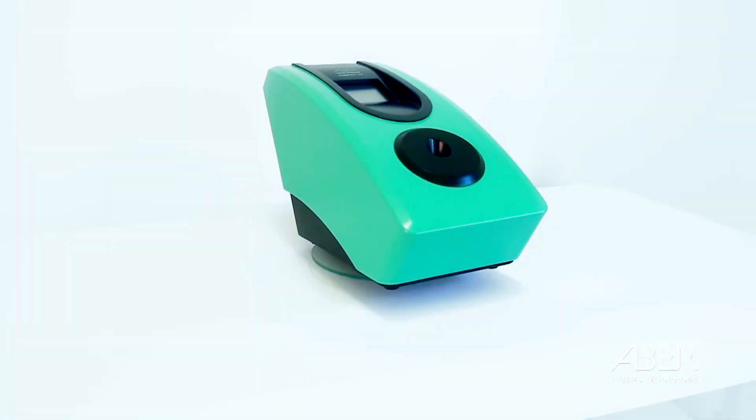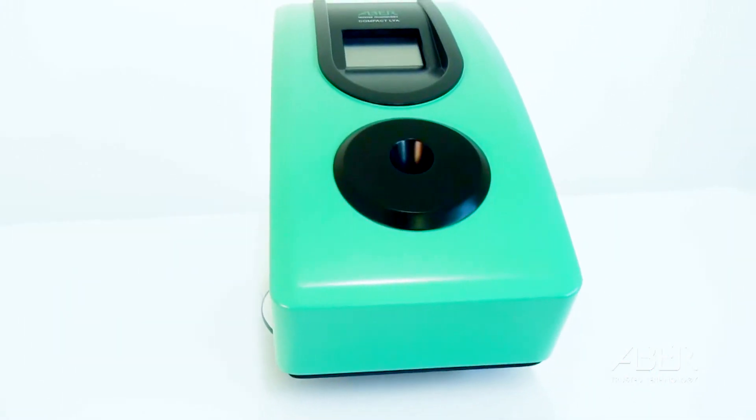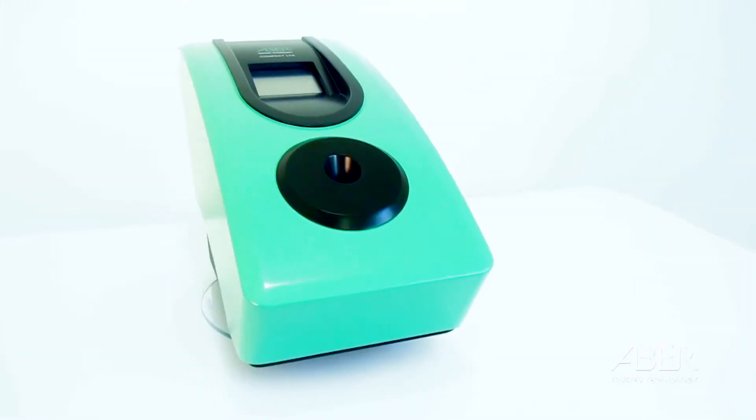Breweries across the world now benefit from using the online Aber technology to dose the exact amount of yeast into each fermenter. The same technology, using an identical probe and touchscreen transmitter, is now available as a laboratory instrument.